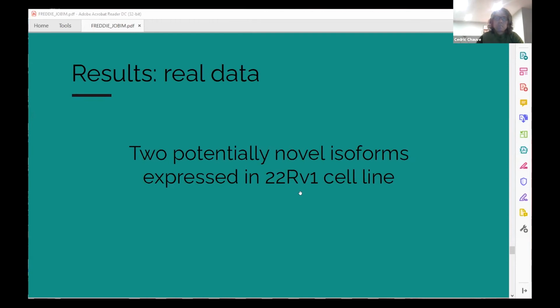Okay, nice. A question from the third room of Montpellier, who asked, do you find RNA fusion boundaries? No, not with that tool. That's actually another paper of our group that is being finalized right now to detect gene fusion from transcriptomic long reads data. Sounds good. A question from Laurent Jourdain, who asked, do you plan to join the LRGASP challenge? It is a dedicated challenge on de novo annotation. I didn't know about that, but then I will definitely look into that. Yes, that sounds interesting from the name.